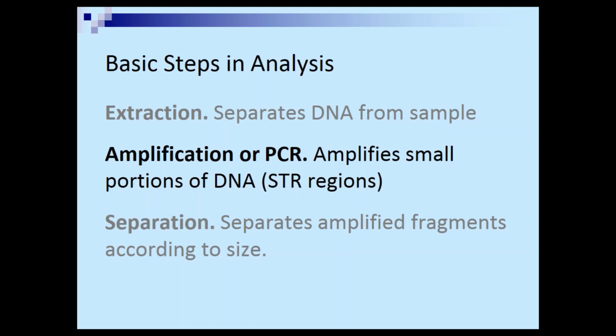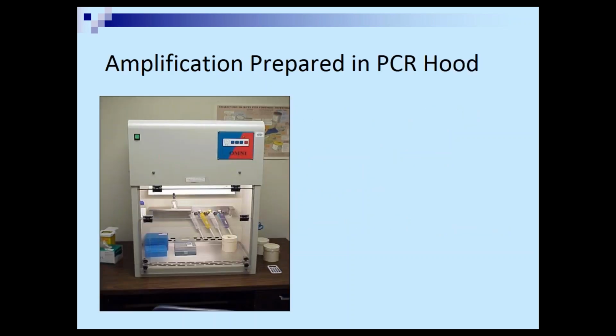All right. And here you begin the amplification process. Now, the amplification process is not going to be where you amplify all of the DNA. Okay, so it's important to understand, if you get arrested for a crime and they take your sample and it goes to the forensic science laboratory, they're not amplifying all your DNA and going to inject it into a clone frog and make a frog twin for you.